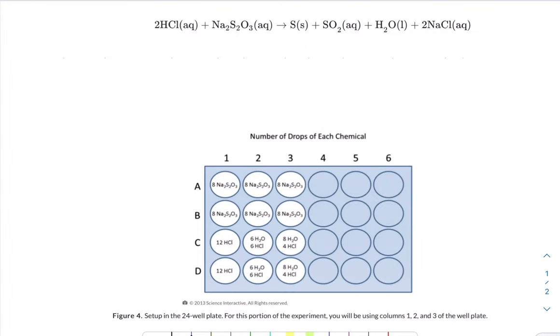In today's lab you are running this reaction that you see at the top of the screen. This works by adding HCl and Na2S2O3, both of which are colorless. You have a jar of each in your kit. Once they run the reaction and you get these products, the sulfur, which is a solid, will precipitate out.